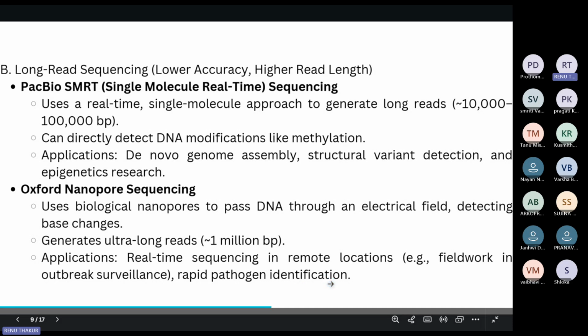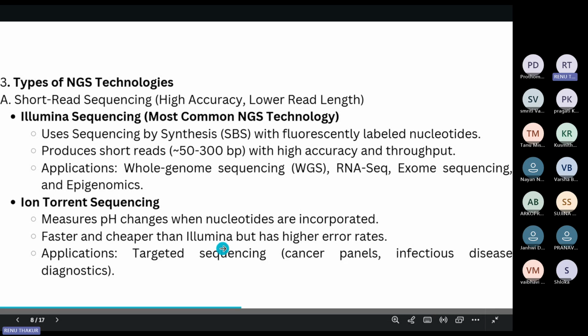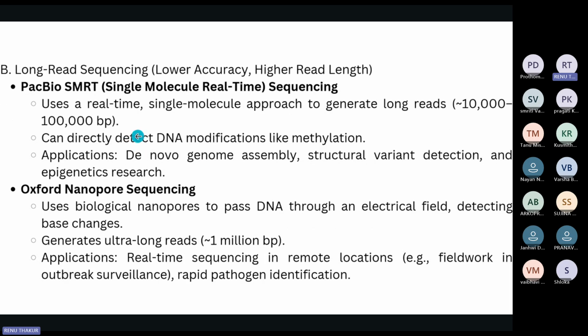Okay, so these are the types of NGS technologies. We will be focusing on Illumina sequencing since it's the most common NGS technology. So we'll be studying this in detail. Okay, and the others are just for your knowledge and reference.